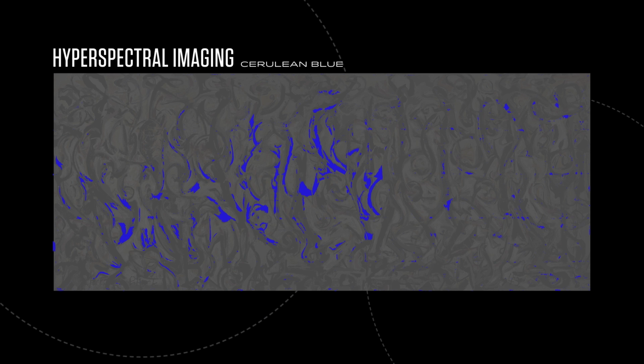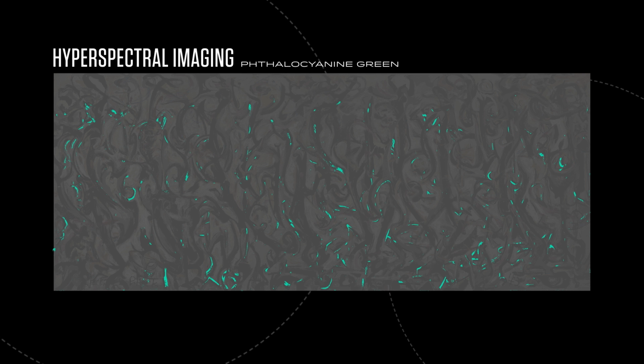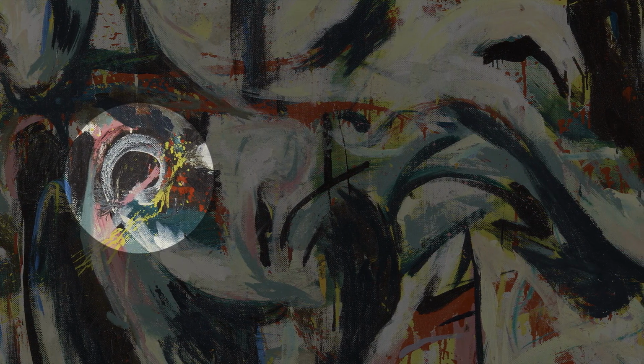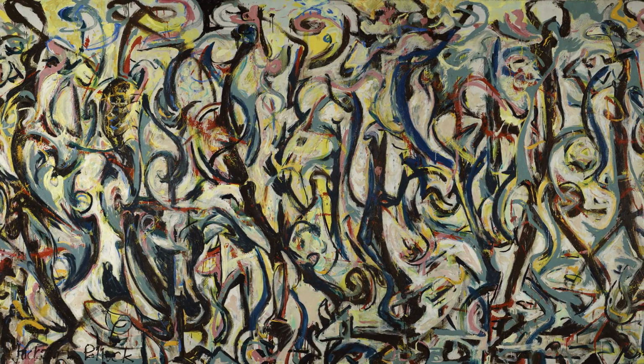We've used quite a range of analytical techniques, and we were able to identify that the majority of the paints in Mural are actually oil paint, and high-quality artist oil paint at that. The finding of casein house paint alongside all the oil paints in Mural was really something of a surprise, rather unexpected. We think that Pollock chose that particular material for its qualities of being opaque, bright white and covering, and quick drying, to fill in the background reserves between all the coloured shapes.